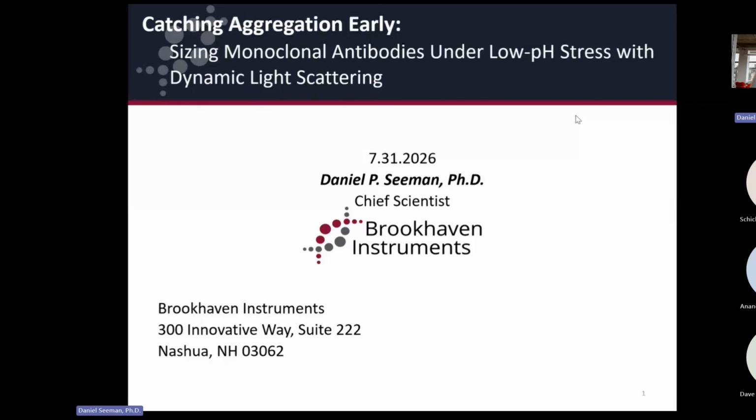So the topic of today's webinar is basically detecting aggregation of monoclonal antibodies using dynamic light scattering, specifically under low pH stress conditions. So as Dave said, I'm Daniel Seeman, and I'm going to be presenting today.